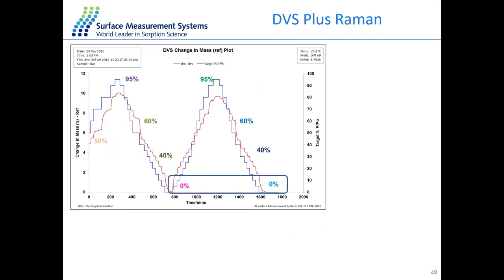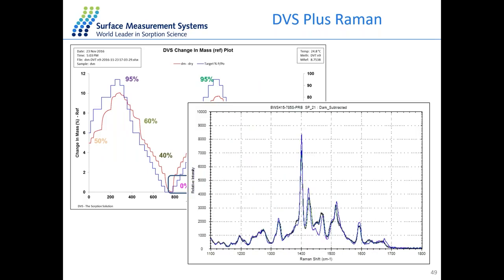However, when we look at the data at the end of the dry stage of the sample, what we see is that the Raman data highlights immediately that there are different positions of the peaks, new peak formation, and a shift in the position of the original peak. Now, this is particularly interesting for the customer that we perform this experiment for, because the customer can immediately understand if the sample is perfectly dry or if it contains any residue of water.